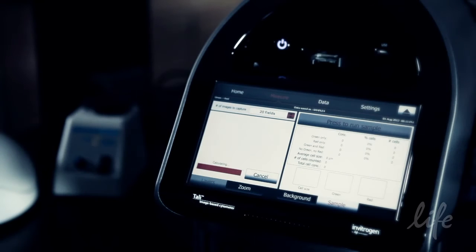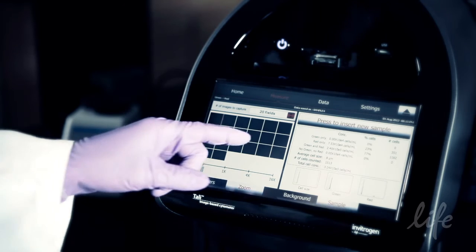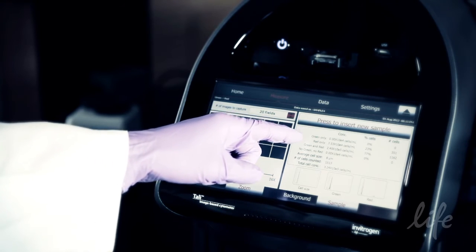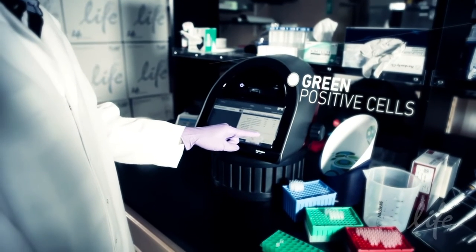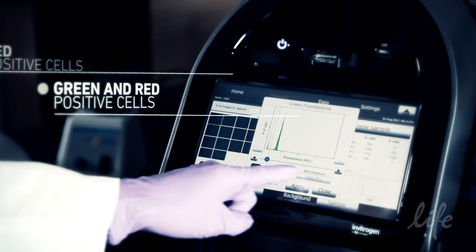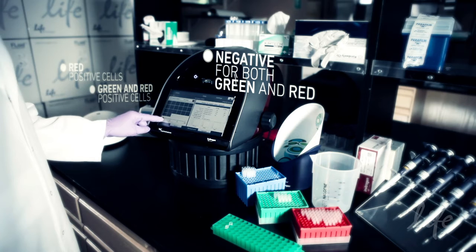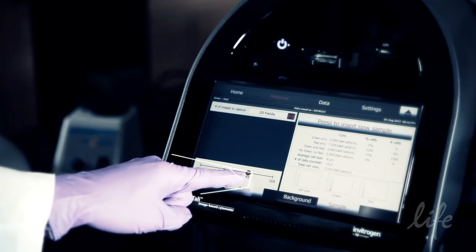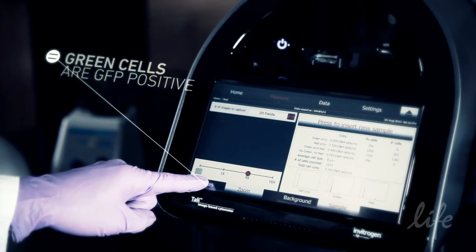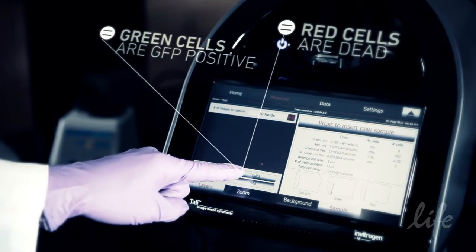After analysis is complete, the Tally automatically ejects the slide and provides the data from the analysis of the captured images in the sample tab. The green plus red assay data includes the total cell concentration, percentage of total green positive cells, percentage of red positive cells, percentage of green and red cells, and percentage of cells negative for both green and red fluorescence. In this assay, cells counted green are GFP positives and cells counted red are PI positive and can be considered dead or dying.